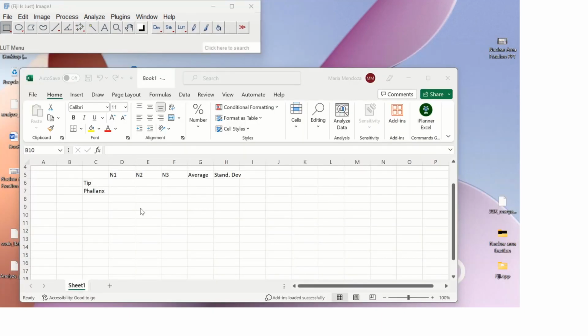Okay, so then whenever you're done saving all of your pictures for your cells, you go ahead and open up an Excel sheet because we're about to start getting our data, our quantifiable data. We're about to extract it from those images.